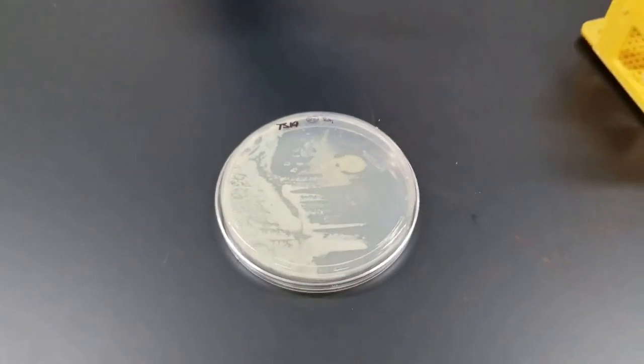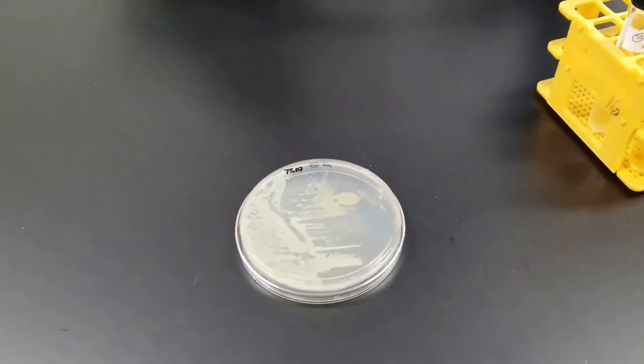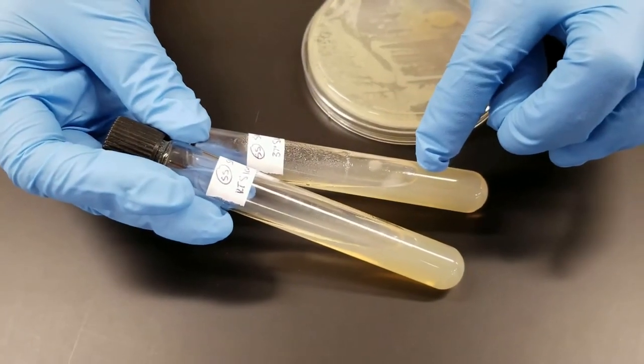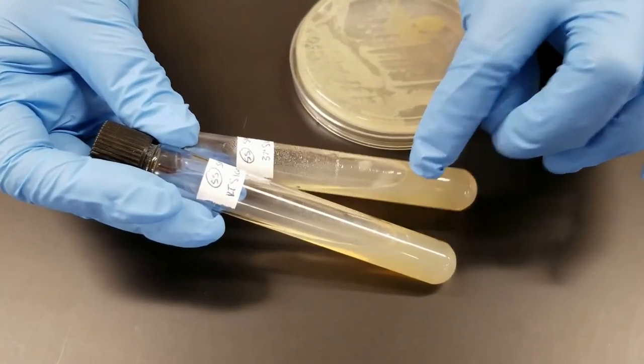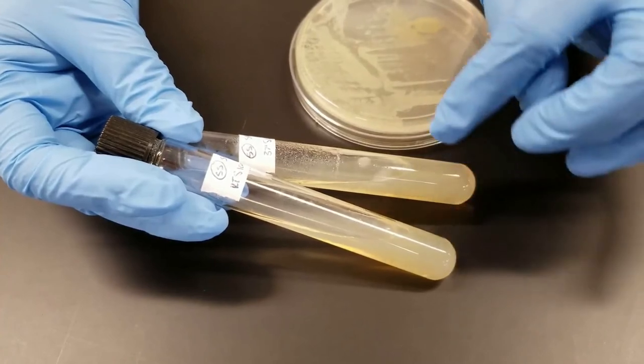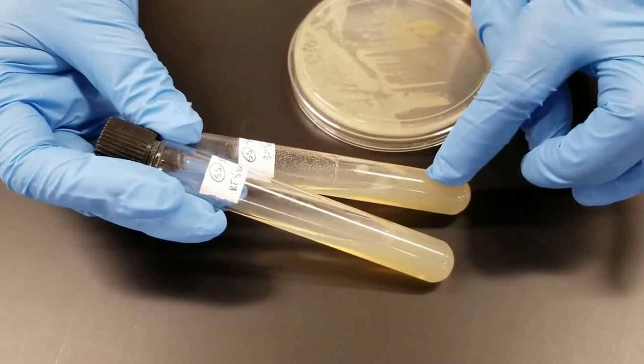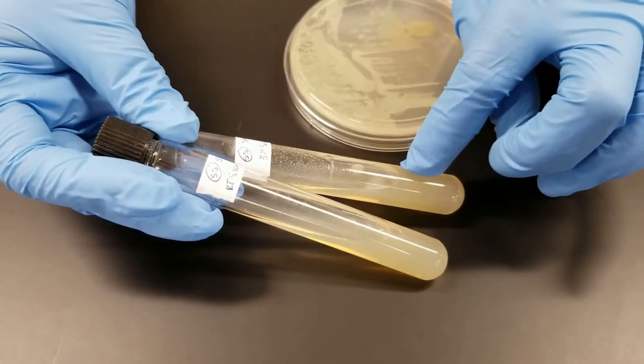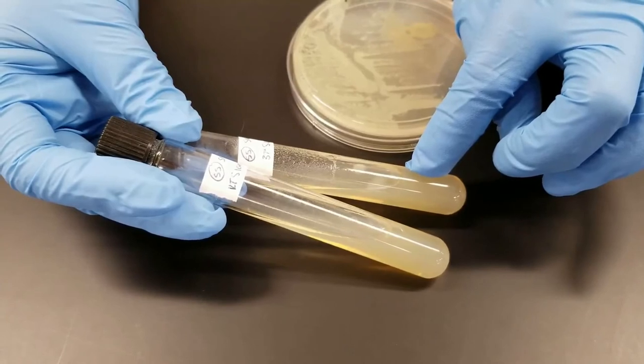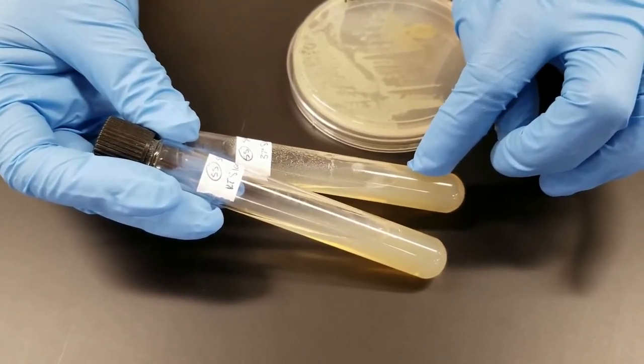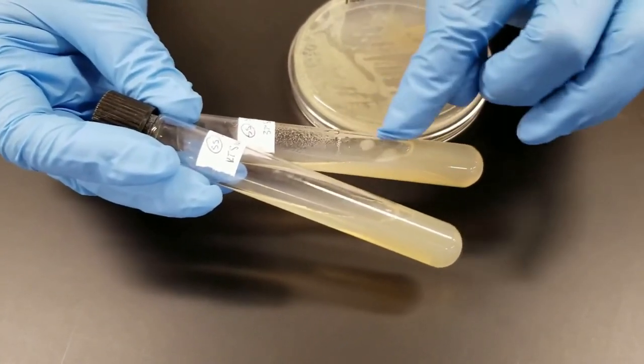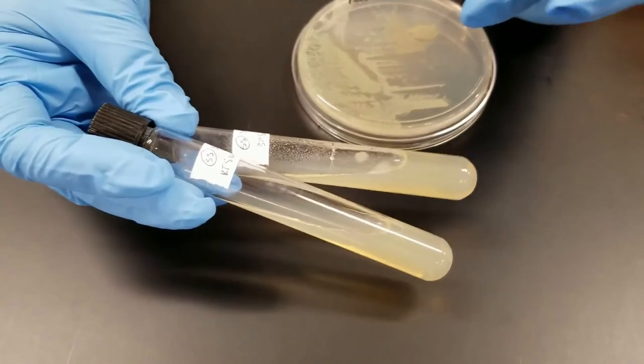We also grew it on slants. And if you compare, this top slant was grown at 37 degrees Celsius. The bottom slant was grown at room temperature, which is about 21 degrees C. You can tell that there's better growth, more heavy growth at the 37. So that would tell you that 37 is closer to its growth temperature optimum. It will grow at room temperature. It's just it will grow better at 37. Once again, we have nice heavy growth on the slant at 37.